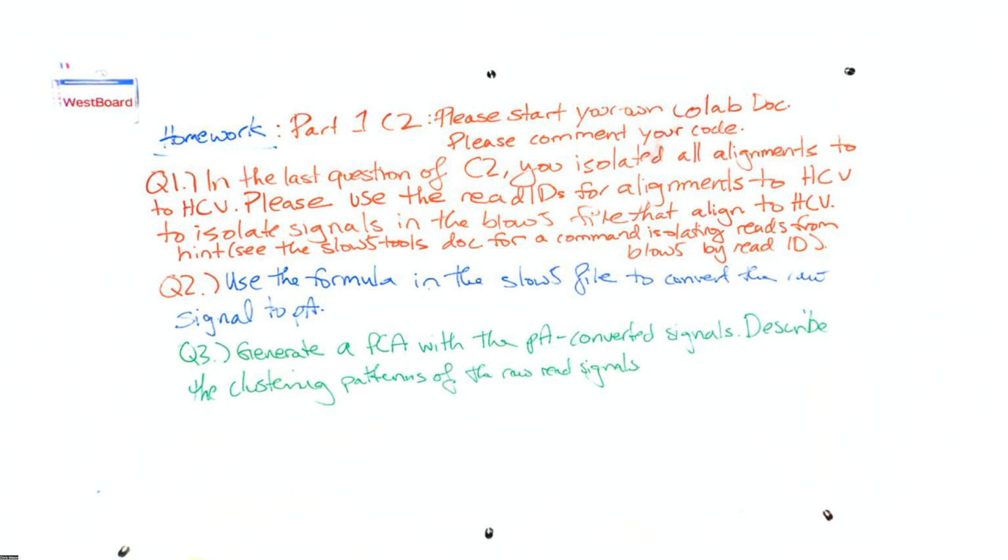If you downloaded the PNG file that was generated by Wally, a command line version of the Integrated Genomics Viewer, you would see that the reads in question are not the most exciting. There are a lot of errors, and it doesn't cover the entire virus transcriptome. Those are really just raw reads from 500 randomly selected reads from the file. So this will be a way to generate data sets with more interesting signals.